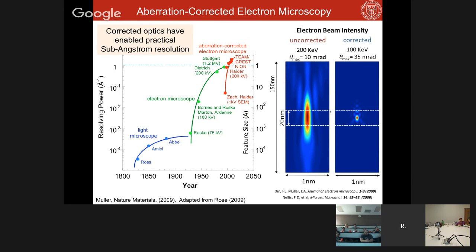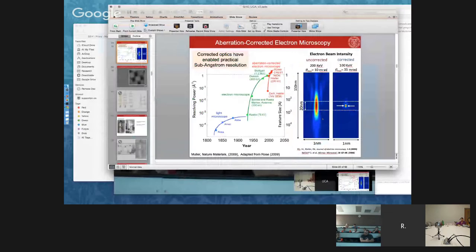But of course the wave function is a complex wave, so how it interacts with the material, you do have to consider the entire complex wave function. It becomes a multiple scattering problem that you can spend a lot of time thinking about the physics of. But in the simple picture, just imagine that this electron beam is a high intensity, highly focused beam, and where it's at a maxima, it will scatter most strongly off of an atom. So if an atom is in this deep red area, then you're going to get more signal. If the atom is off to the side, then this wave function is not going to interact very strongly with that atom, and it won't scatter very strongly. Does that make sense? Yes, that's awesome. That is really remarkable.